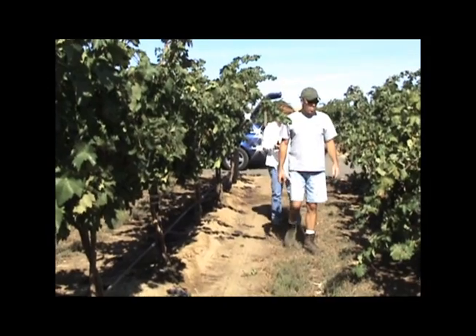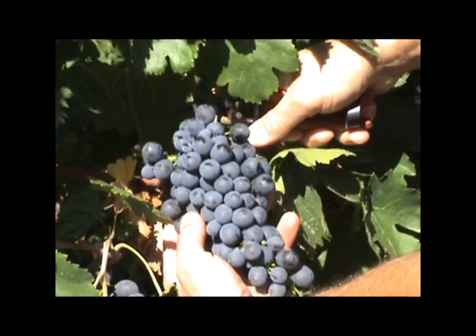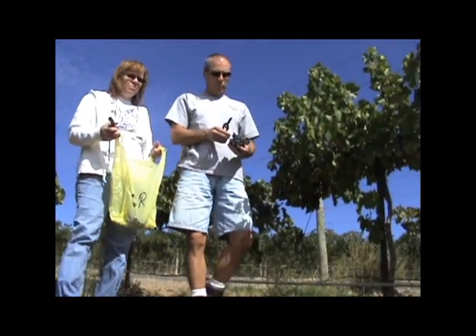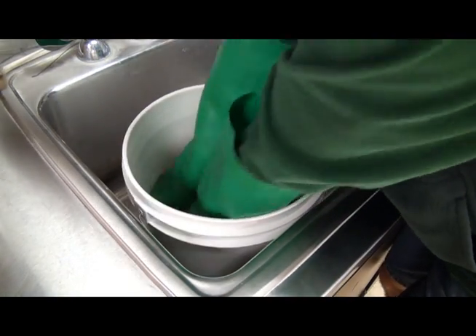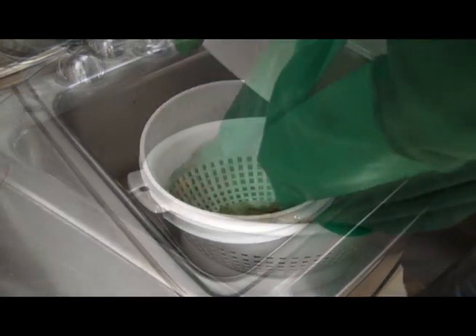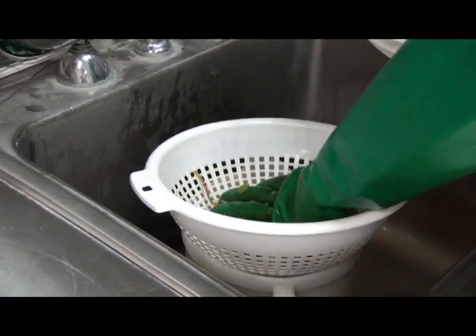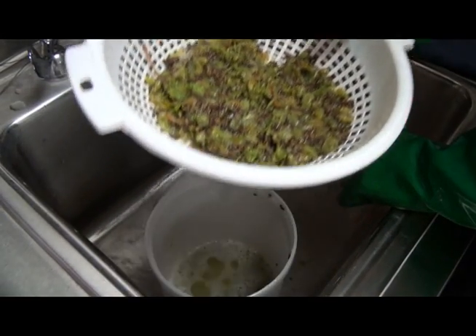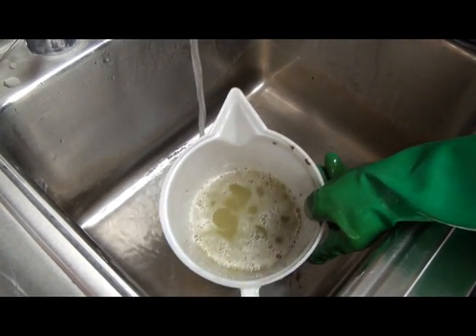A sample of grapes must be obtained. The sample should represent the variety of growing conditions, and not just from a single plant, to obtain a representative sample of the vineyard. Once the grapes are obtained, they will need to be crushed. This can be done manually by placing the grape clusters into a clean strainer. With gloved hands, crush the grapes thoroughly, capturing the extracted juice into a clean container. Mix the sample thoroughly to provide a homogenous sample, and then allow the solids to settle.